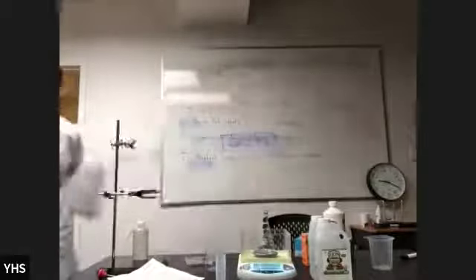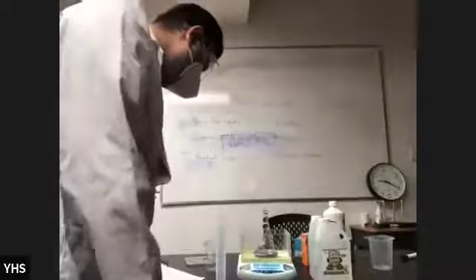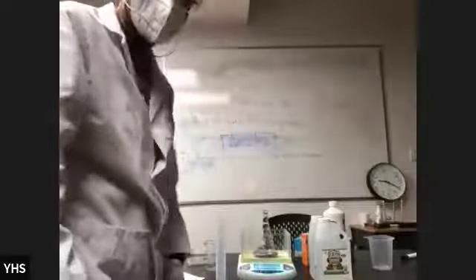So be ready to write this down. Okay, this goes right here, the mass of the empty cup. Okay. And it is 114 grams.